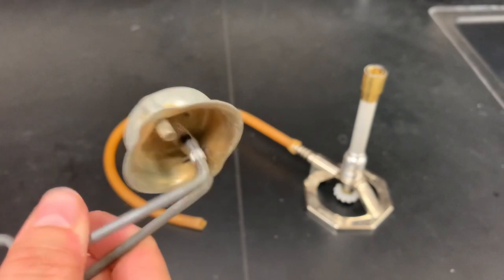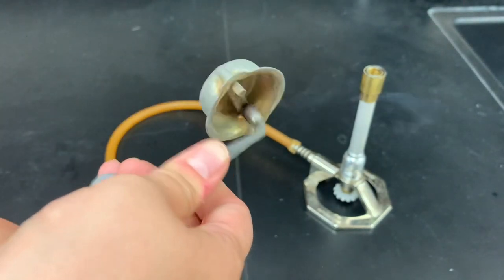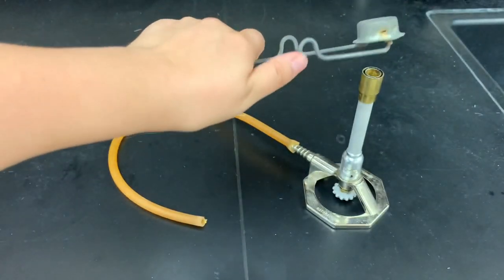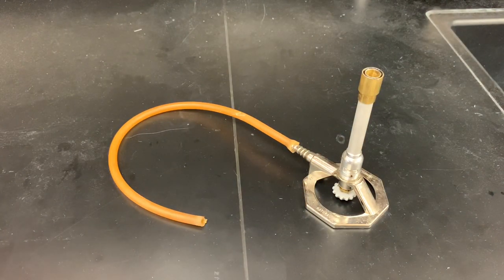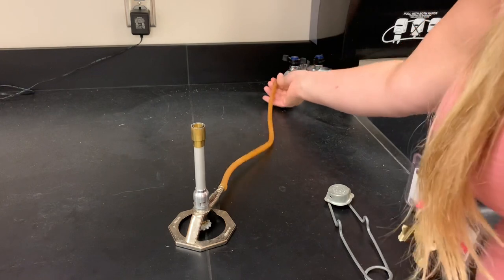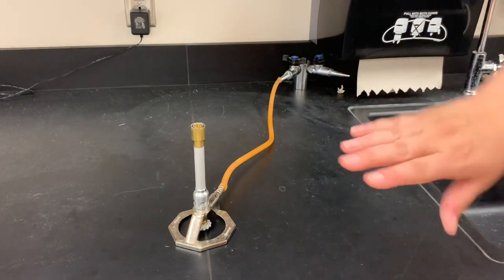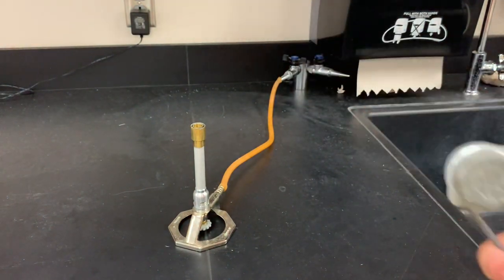When trying to light your Bunsen burner you need a really good spark — the little tiny ones are probably not enough. When you use the striker, push down with your thumb to get a nice solid spark, not little baby sparks. You're going to hold it right over the gas. It's a little scary when it first lights because you feel the whoosh come back at your hands, but no one gets burned that way. As soon as you light it, just move the striker out of the way.